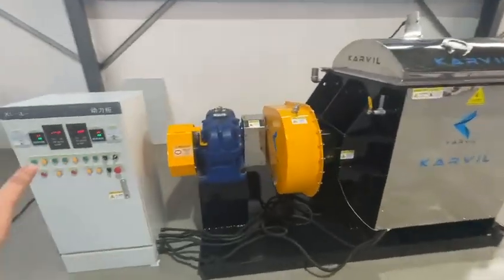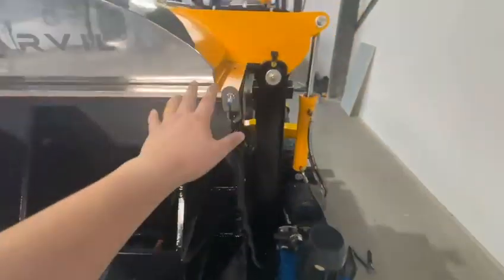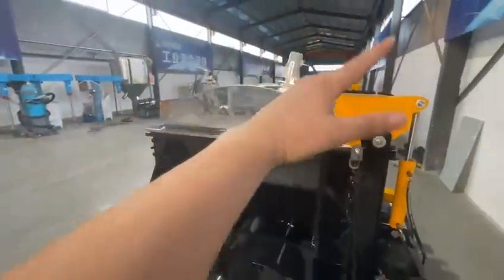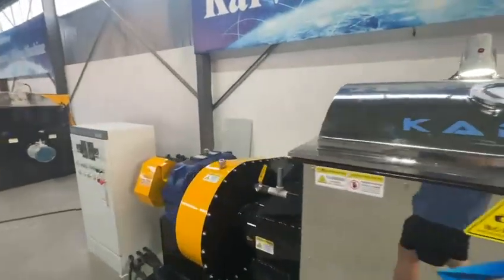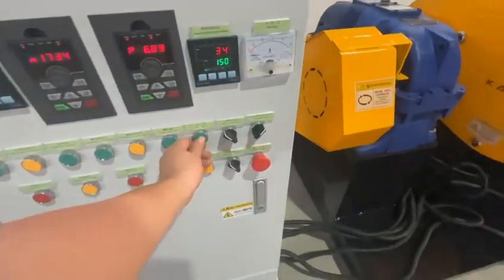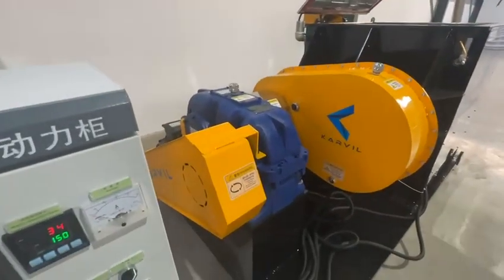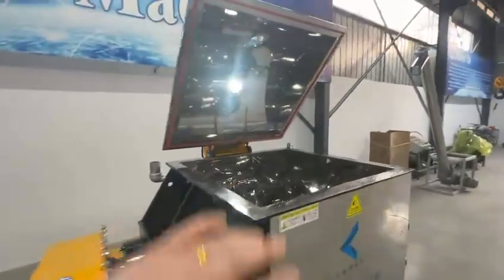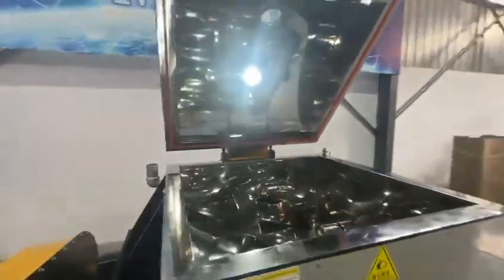We are equipped with a safety protection function via this sensor. Once the lid opens, the mixer will stop to help ensure worker safety. We can see now the lid is open, but the double Sigma blades stop and the discharging screw stops — the mixer stops working. This is for safety consideration.